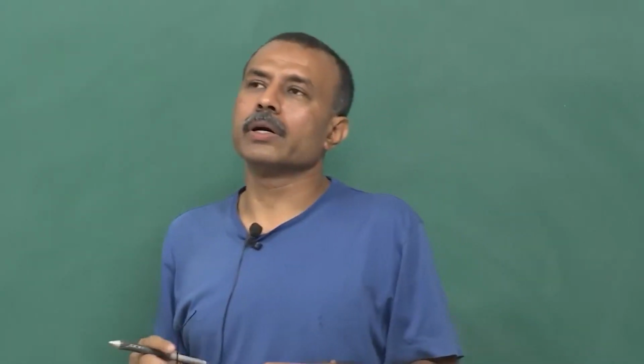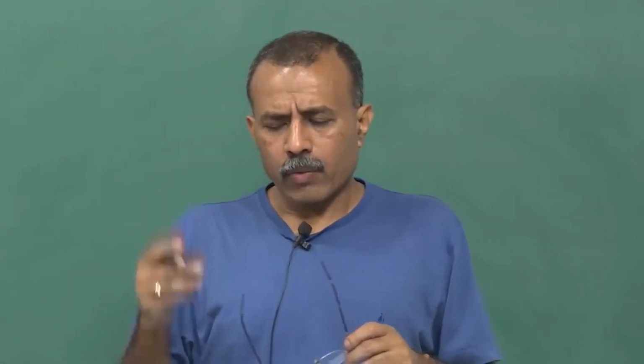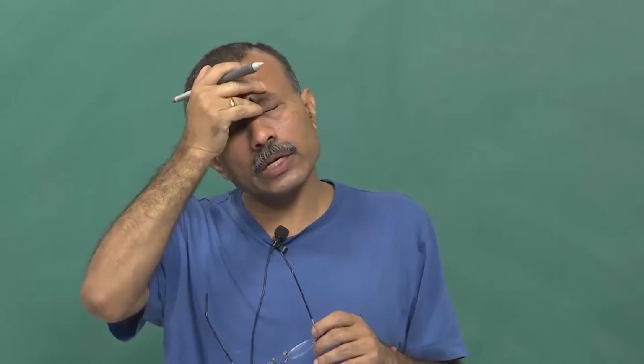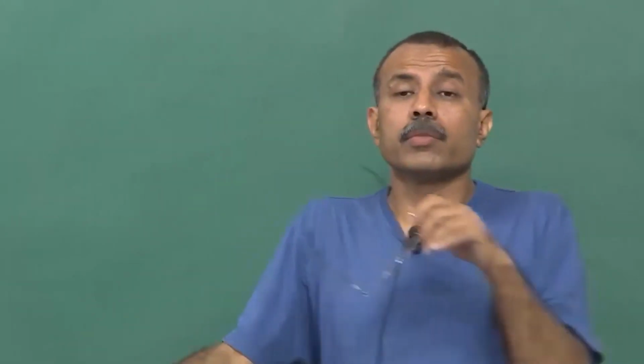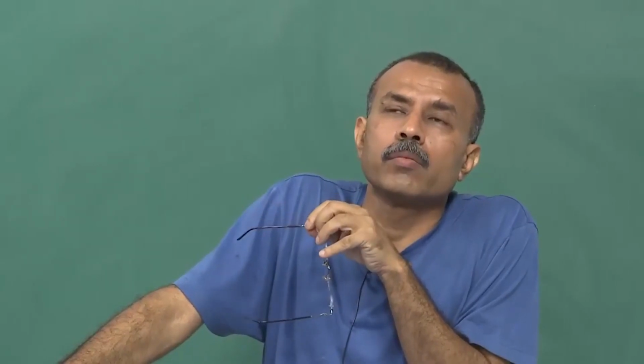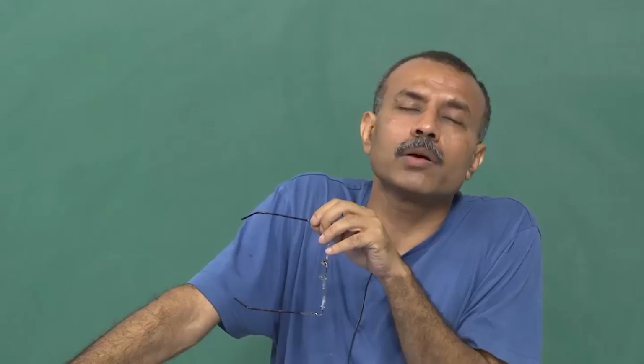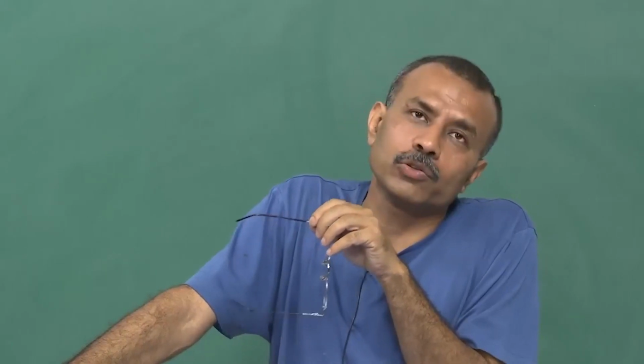From here, we will move on. As of now, if you realize, we are only talking about the change in the potential, but there are situations where you can utilize this technique by measuring the current, and that we will see once we talk about the oxygen and the glucose electrode.